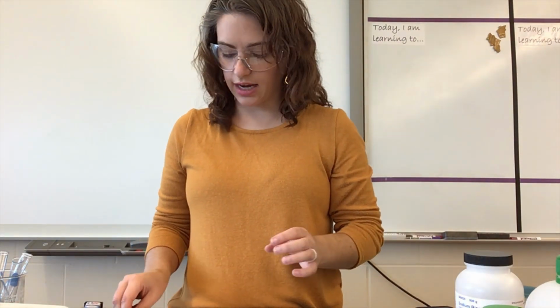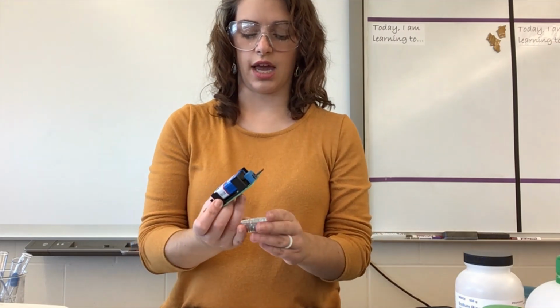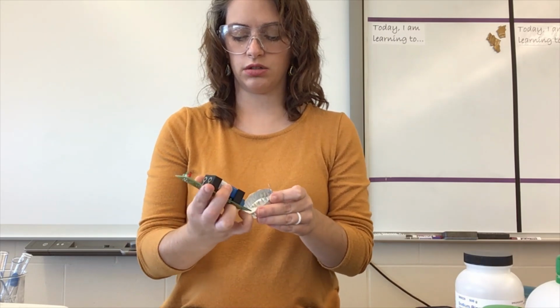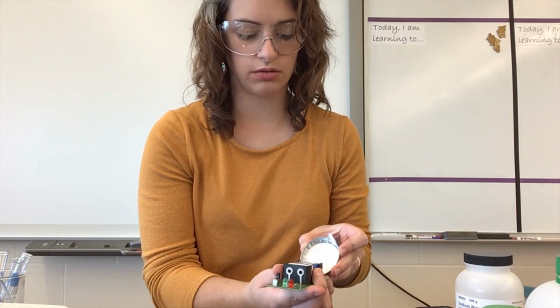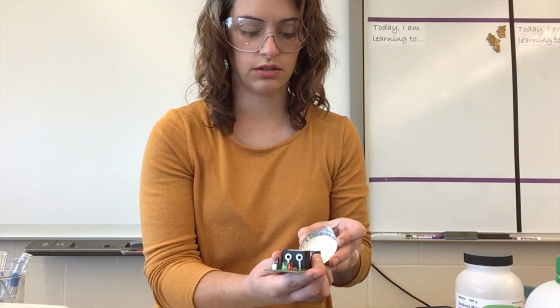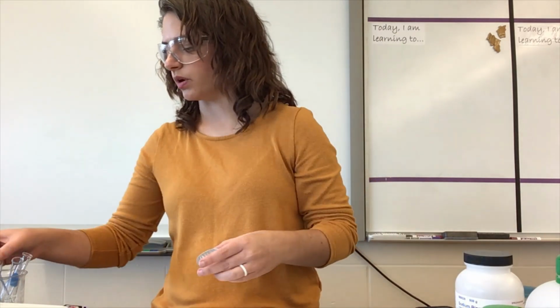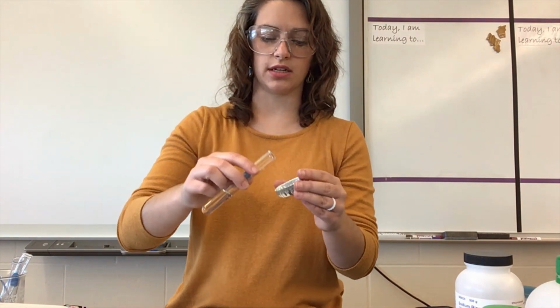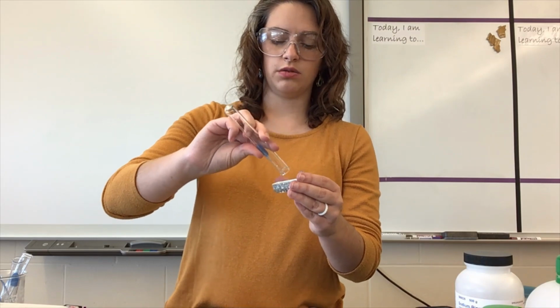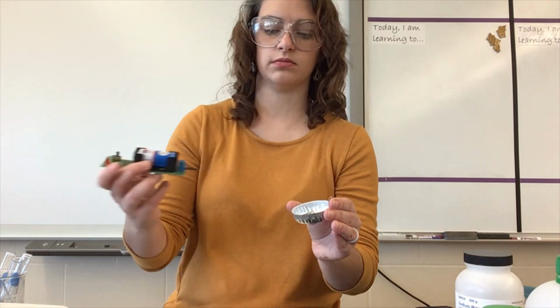Okay, testing conductivity. So we are going to test the solid first. Again, same with the calcium chloride. I'm going to be careful not to touch the aluminum dish, just so that I'm getting just the sample. And I don't see any lights light up. Okay, so not conductive as a solid. I'm going to take my solution that was in my test tube and put it in a clean weigh boat or aluminum dish so that we can see if this one conducts.